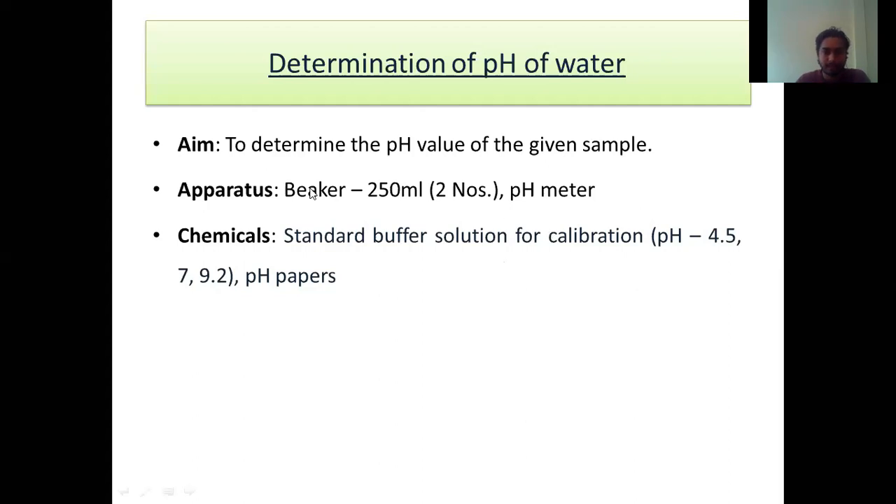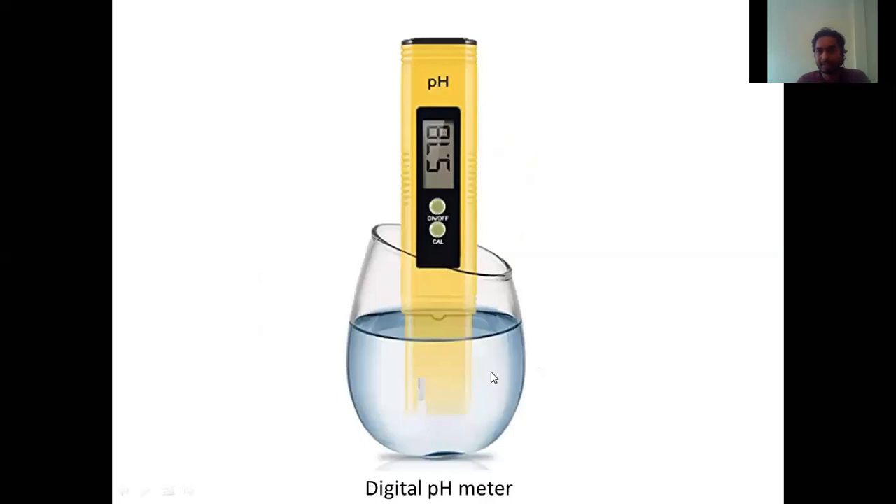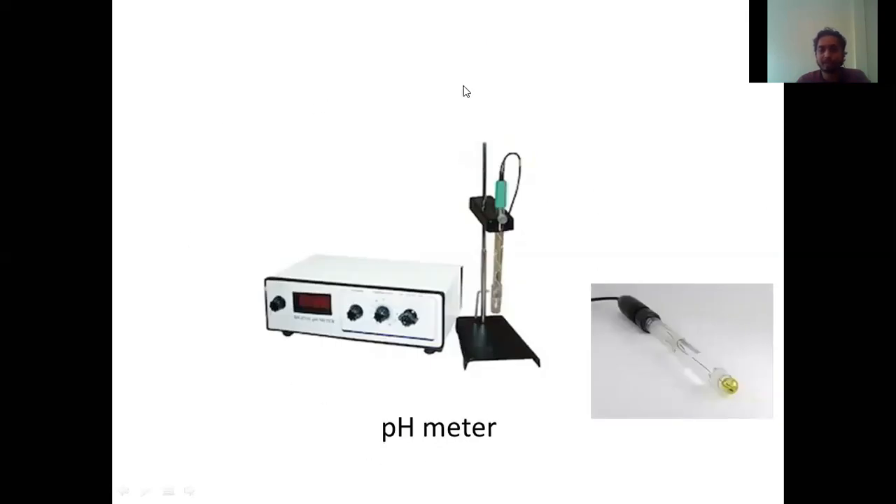As I have already told you about all these things — this is the pH meter which we are going to use. The same specification and the same equipment is also available in our college. This is called the pH meter, and this is the electrode which we are going to dip inside the liquid of which we have to calculate the pH. Another equipment is this digital pH meter, which is more handy. For domestic purposes we use this one.